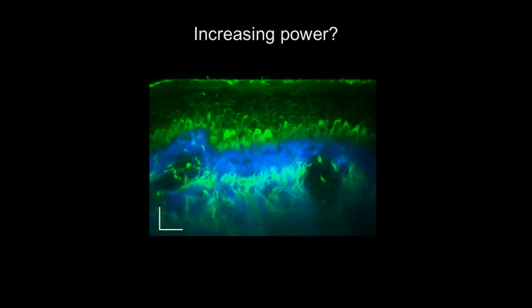Okay, now here's the same picture once again. Let's look at this a little bit more carefully. If you look at this picture, and again, the depth here is about 120 micron. Okay, so keep that number in mind. It's very relevant. So beyond 100 microns, things get a little murky. Because look at this structure here. I see a lot of definition here. I see more hazy things from here. It doesn't mean your tissue is hazy there. It means you just get less meaningful signals back.